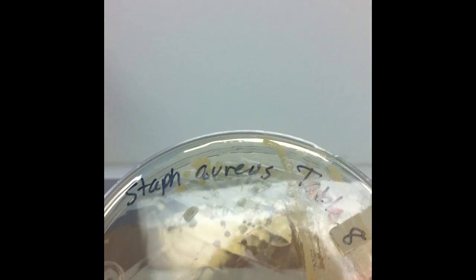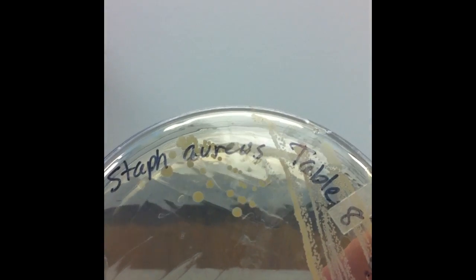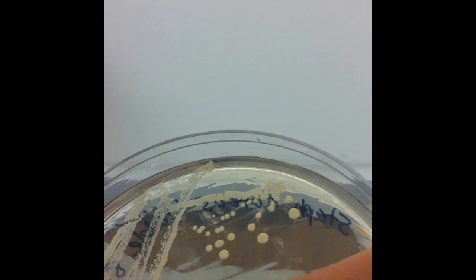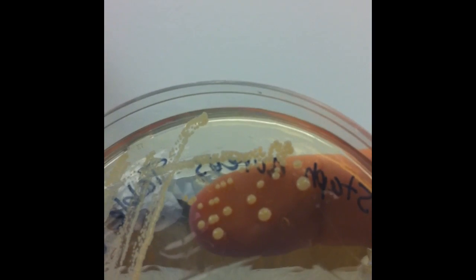Here we have Staph aureus. The word aureus refers to the chemical symbol for gold, which is Au. This is sometimes called golden staph, and while it's not as bright lemon yellow as Micrococcus luteus, it does have kind of a yellowish tint to it. These are round, smooth colonies. This plate is about a week old, and you can see from my fingertip how big these colonies are. That would be Staph aureus.